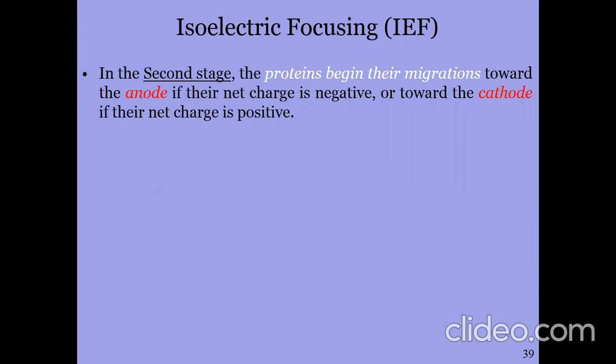सो प्रोटीन ने अब क्या करना है, प्रोटीन लोडिंग होगी और उसने प्रोटीन ने माइग्रेशन शुरू कर देनी है। तो अगर नेट चार्ज जो है वो नेगेटिव होगा प्रोटीन पे, सो दैट विल मूव, द प्रोटीन विल मूव टुवर्ड्स एनोड। इससे पहले हम देख चुके थे कि एसडीएस को साथ ट्रीट करने से वो जो लाइक पूरी प्रोटीन जो है वो नेगेटिव चार्ज हो जाती है एंड दैट विल मूव टुवर्ड्स एनोड। एंड सिमिलरली इफ दैट इज पॉजिटिव चार्ज, so that will move towards cathode.